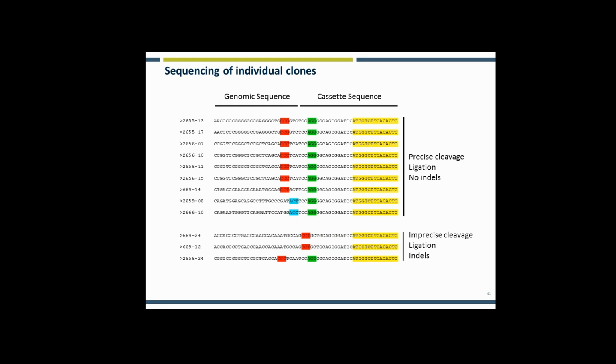So we very successfully incorporated our tag into multiple different genes, but because we hadn't anticipated the precision of this system, we generated a lot of clones that we couldn't then use. Since then, we've created a suite of self-cleaving donors to account for all possible frames, and we would then use the most appropriate frame donor for each particular targeting event.